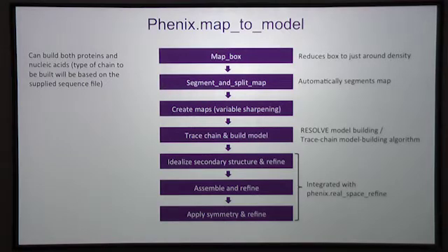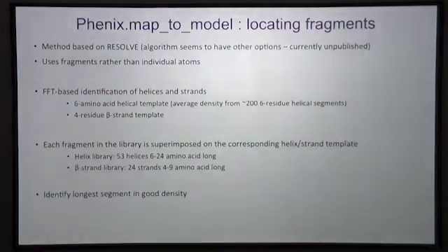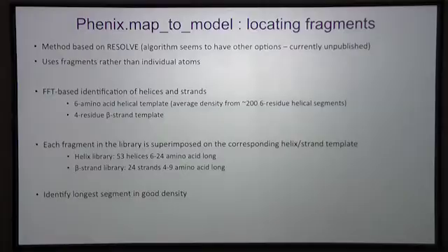There seem to be multiple algorithms to do the model building, but the method is not yet published. But one of the methods it uses is Resolve. And Resolve is an old program developed for interpreting crystallographic maps. The idea here is that rather than use individual atoms, it uses larger fragments. And larger fragments are more robust, and so you can potentially build at lower resolution.